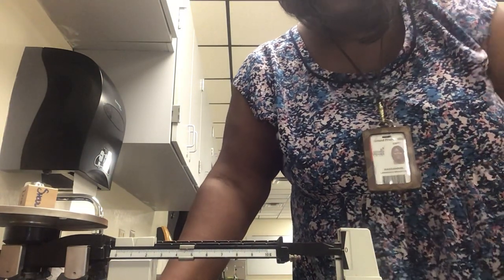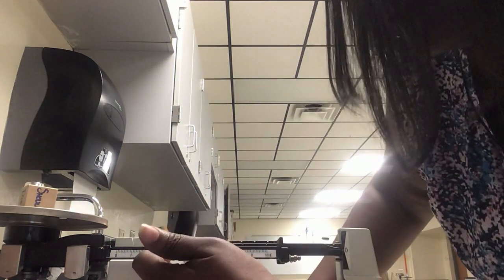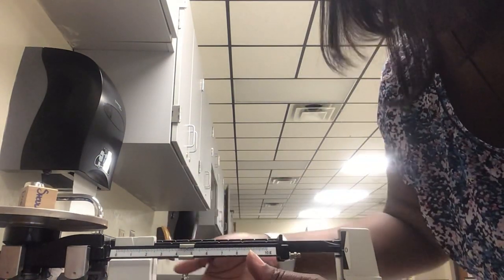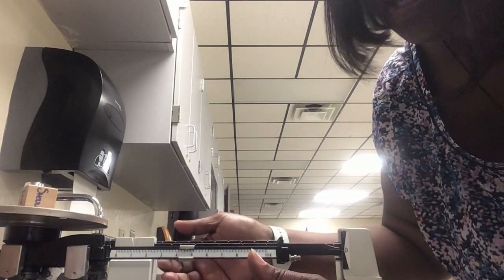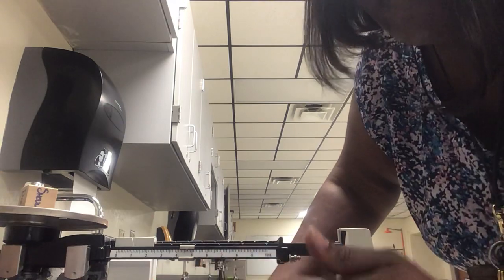All right, so it's on 0 now. So if you notice, it's a little bit between the 4 and the 5. So when you do this, you have to add up your grams. So at the back, we had 10 grams, plus up here we have 4.5.